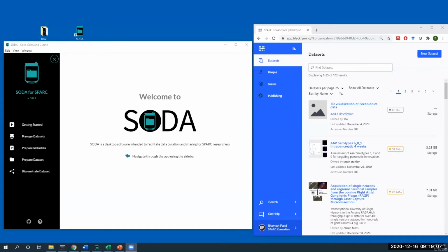Thanks, Anna. Hi, everybody. I'm Bhavesh. As Anna mentioned, I'm developing this software called SODA. And today, I'm hoping through this demonstration, I'm going to convince you that SODA can make your curation and sharing task a lot easier. And as Anna mentioned, SODA can be downloaded and installed on any computer or laptop.